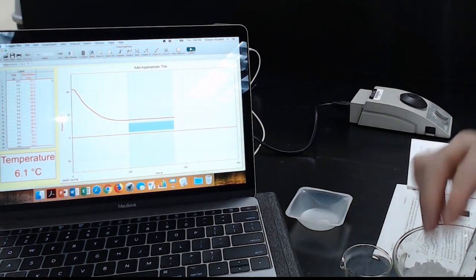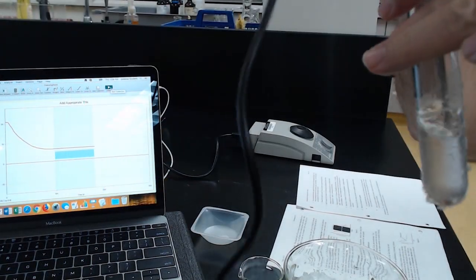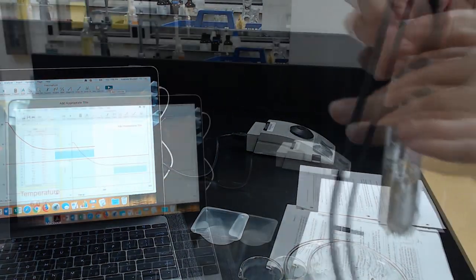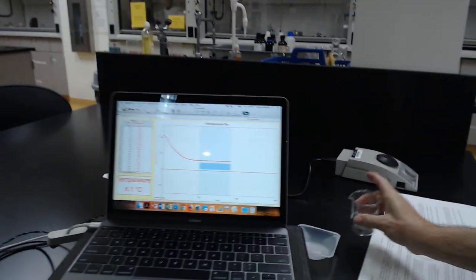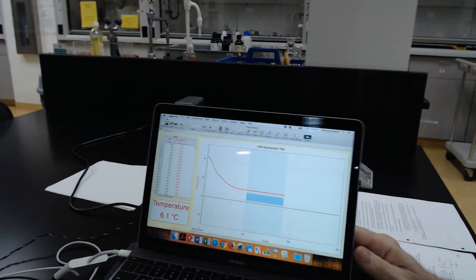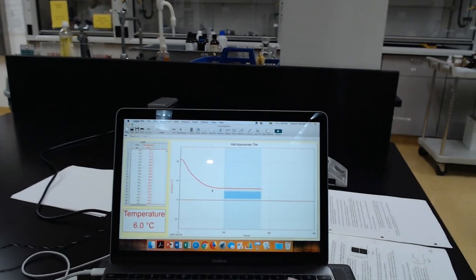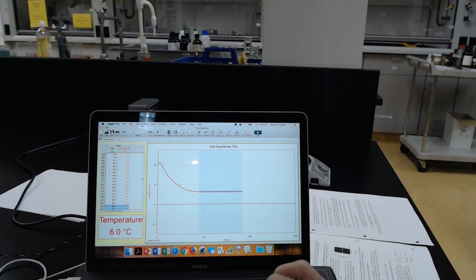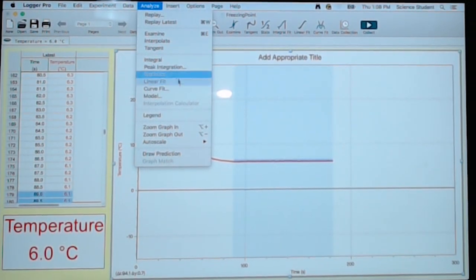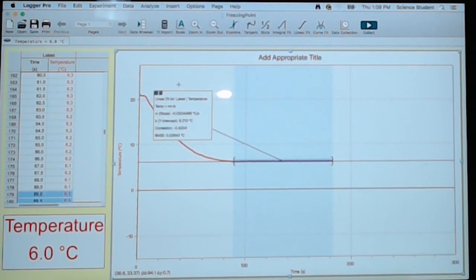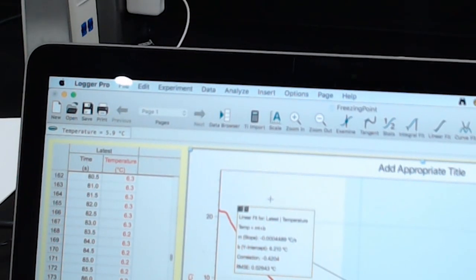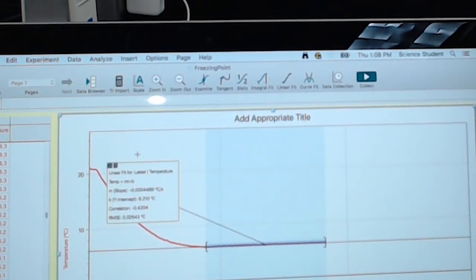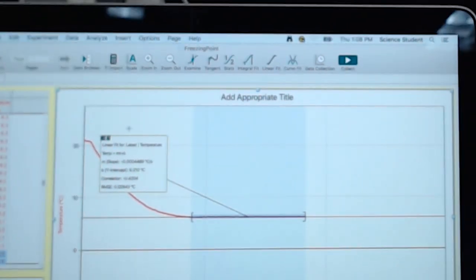So the colligative property, it matters how many particles there are in solution. We use this. Cyclohexane has a nice freezing point compared to that of water. And naphthalene behaves like a normal solute. It behaves like a normal solute. And it gives good numbers. Not everything behaves normally, unfortunately. Oh yeah, look at that. It's really flat. This is a good value here. Let's see. We're supposed to go to three minutes. Where are we at here? We're 30 seconds away. Yeah, you can see it's going to be 6.1. But we'll do a graph on it. Do a linear fit. 78, 79, 180 seconds. Good. So we'll stop the button here. And it still has a little bit of liquid in here, but it's definitely mostly solid.